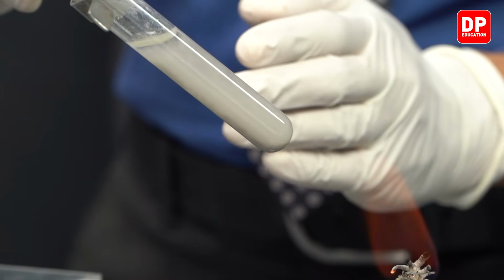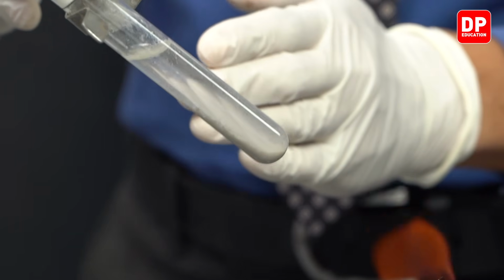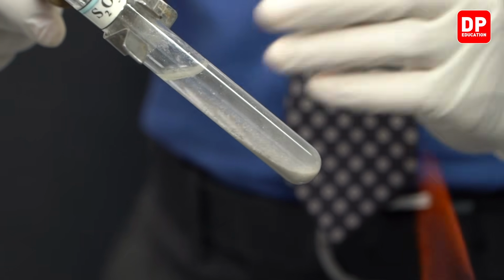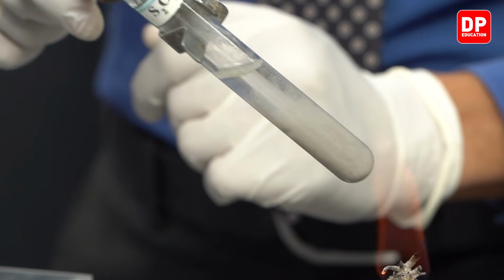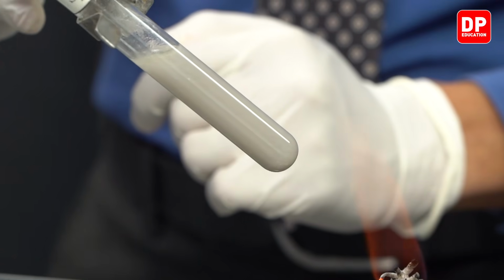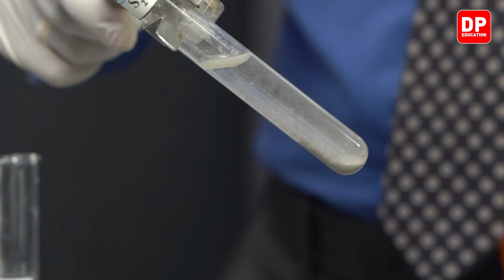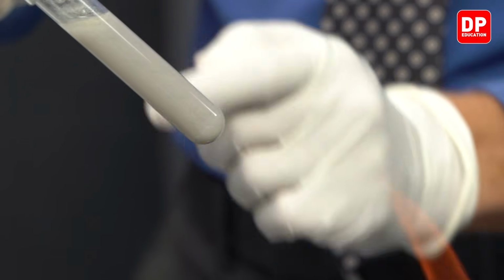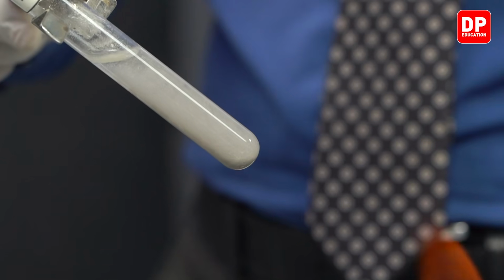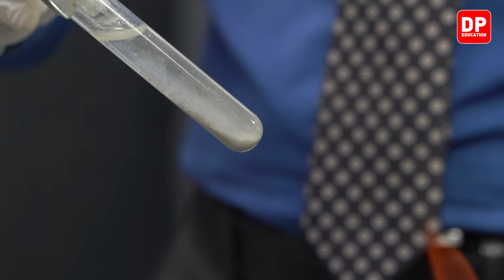As we heat it up, you can very clearly see that it is undergoing a change from white to a black color. Currently, it is a darker gray color, as I mentioned earlier. As the water gets boiled, you can see the suspension is getting mixed with the aqueous solution, and you can very clearly observe the color of the precipitate. So the color of the precipitate is no longer white.